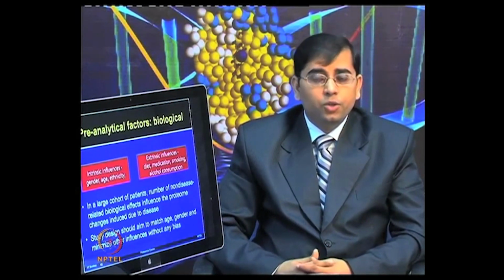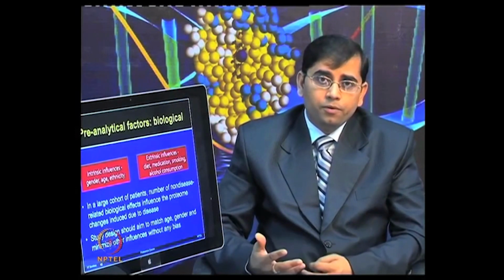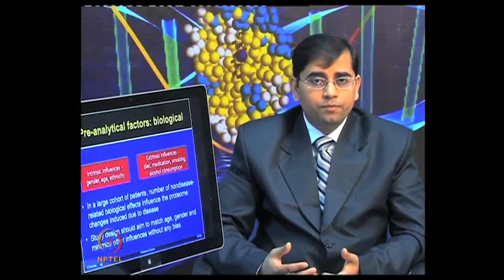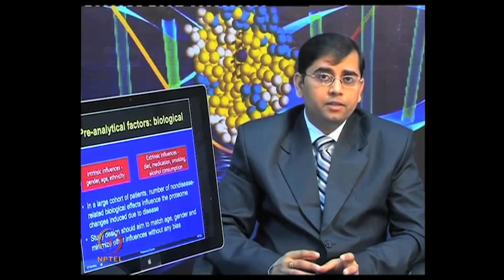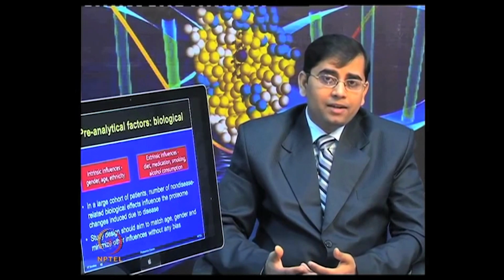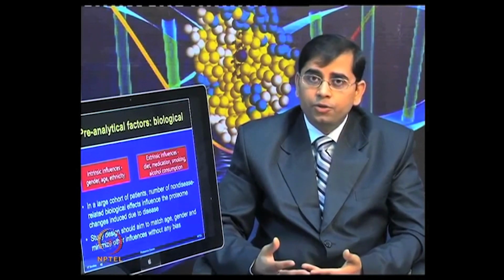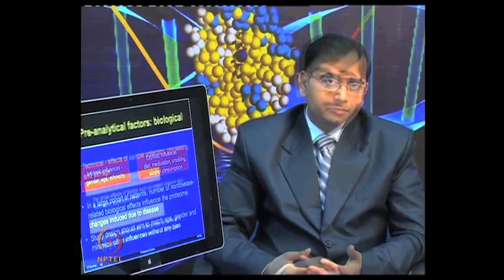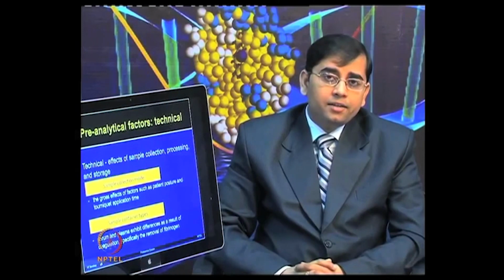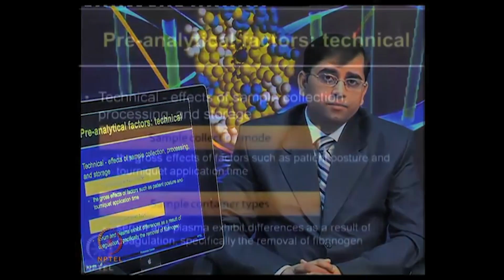Often it is very useful to involve a statistician before you are designing these types of experiments and thinking about different pre-analytical factors. Before you actually perform your experiment, this is often going to determine how successful your analysis is going to be.